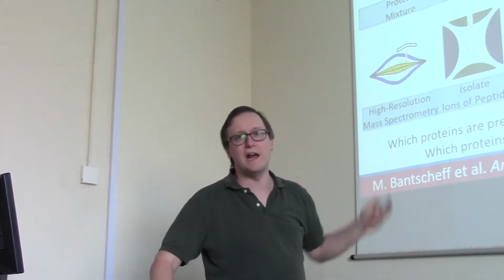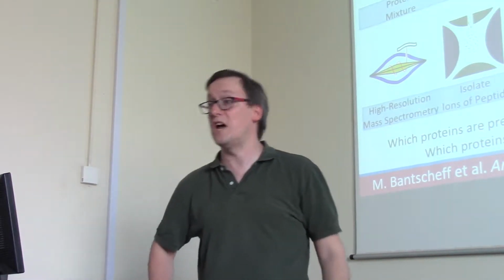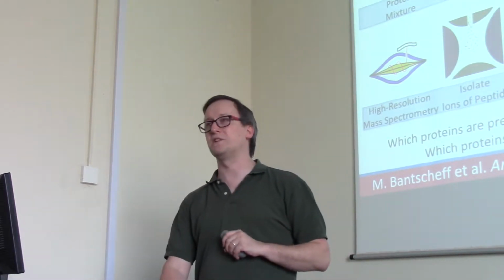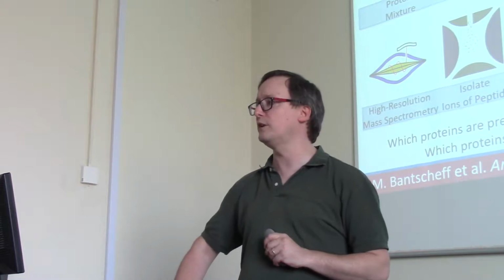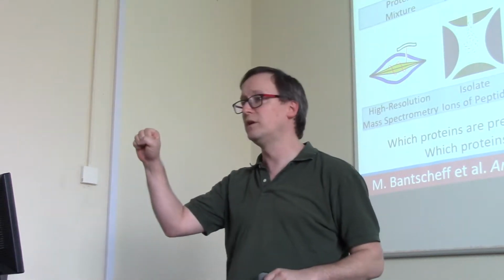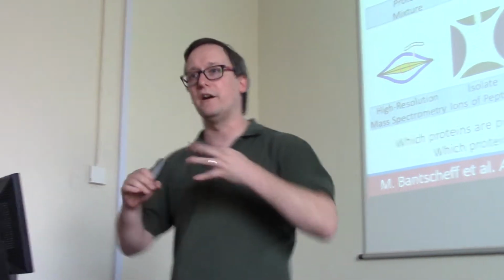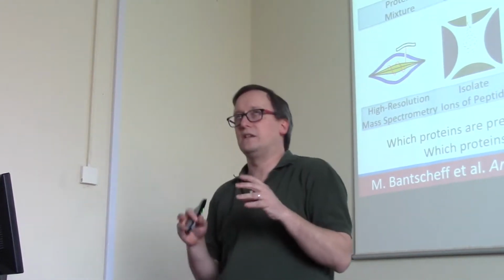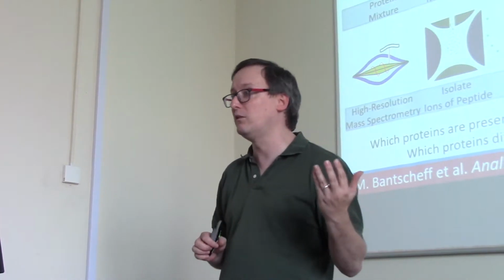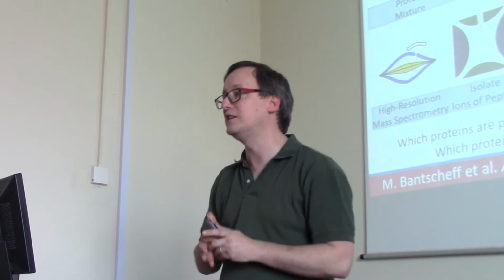Each of these peptide fractions can then be subjected to a separation, and the most common separation that we see in proteomics is liquid chromatography. Specifically, reversed phase liquid chromatography, where we have beads that are absolutely covered with C18, long chains of carbon. And hydrophobic peptides love that. That's brilliant. But if you've got a peptide that's covered in arginines and acidic and basic residues, well, that's not going to stick so very well to these materials. So they're differentially adhering to the beads in these columns.